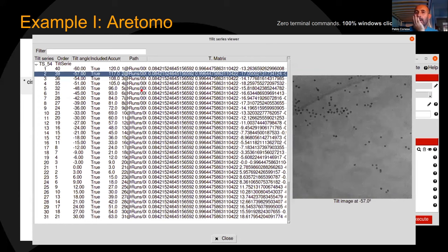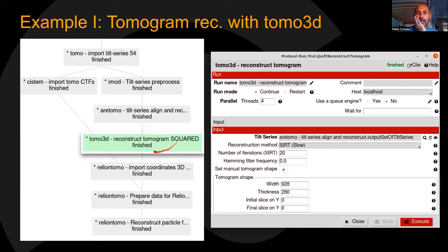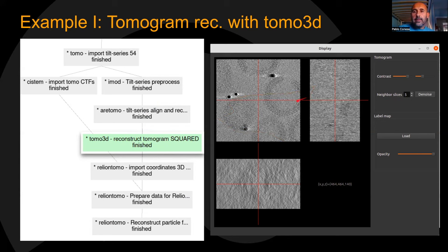The output of AreTomo is basically the same as the input tilt series, but now the transformation matrix column is populated — encoding the shift and orientation to be applied to each tilt to align the tilt series. With this information, we're ready to go to Tomo3D. We feed it with the AreTomo outputs, populate some parameters, and execute. The output is shown with the Dynamo viewer — though I think Dynamo is moving to Napari, so this viewer will likely be replaced soon.